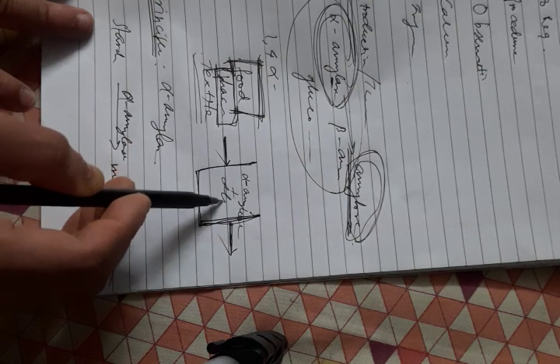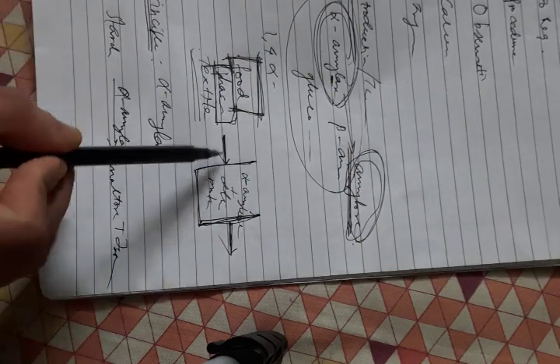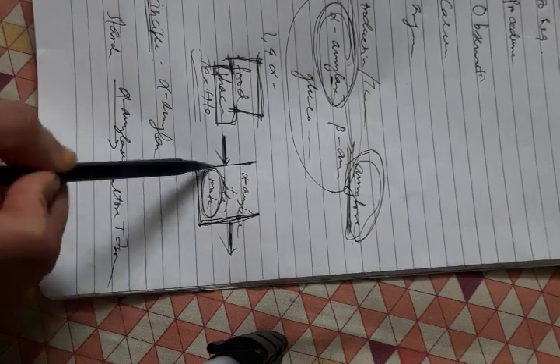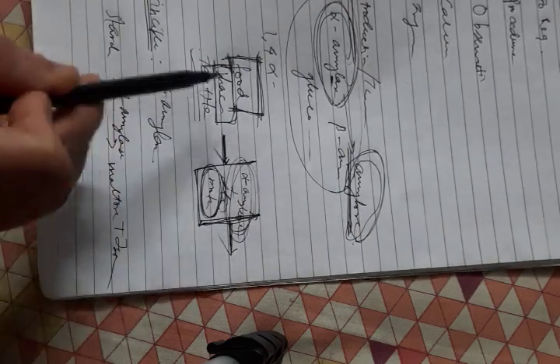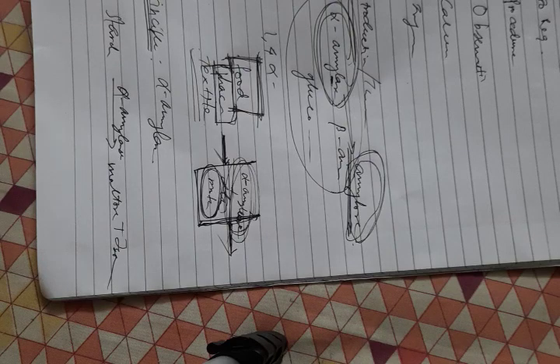So the problem is that when we use this method, we are also counting the concentration of other proteins as the concentration of amylase. So that's the problem, right? We only need to find the concentration of amylase. So how can I do that?